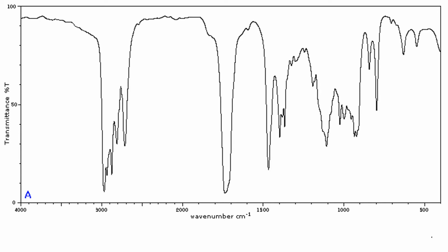And if there is a bond present, that bond will absorb a certain frequency of light. And it will absorb that certain frequency of light by bending or by stretching. And those different bends or stretches are indicative of the presence of certain types of bonds. What do I mean by that? Well, we can see on this graph, this peak right here.